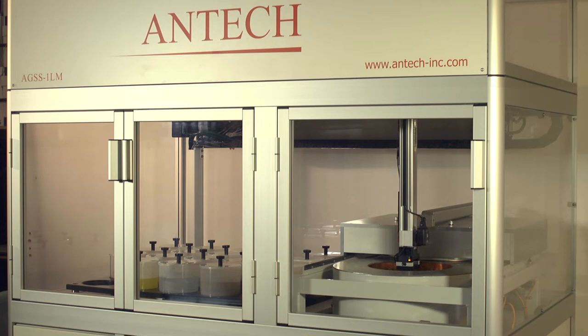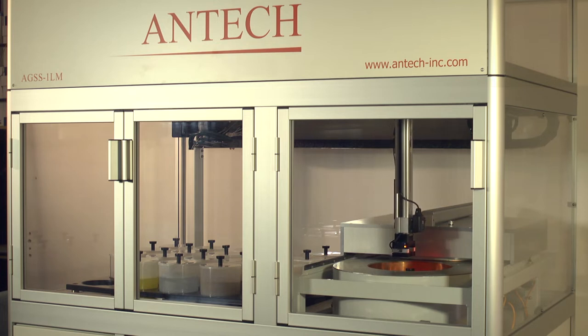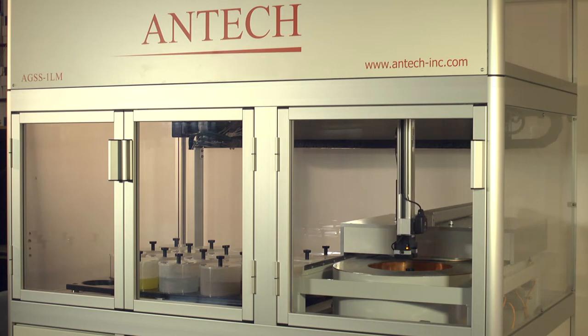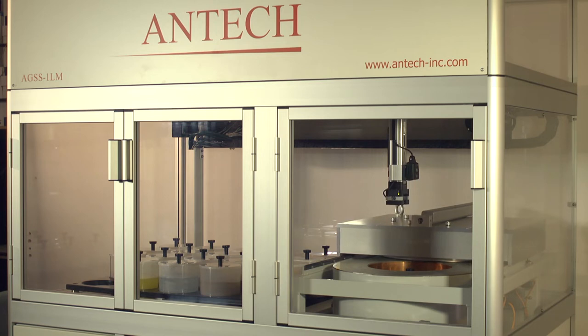The AGSS is designed to use a high-purity germanium detector from the ORTEC range and an ORTEC digital multi-channel analyzer such as the DSPEC-50. Options for germanium detector cooling are available and encompass conventional liquid nitrogen and ORTEC electromechanical detector cooling systems including Xcooler 3, Mobius, and the new ICS integrated cooling system.